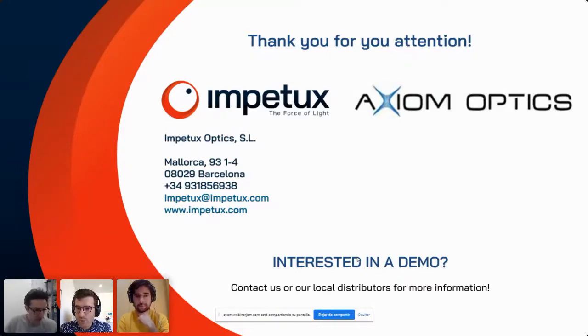We had a first question from Min, which was, what difference in index of refraction between sample and solvent is required in order to trap an object with the system? To which Arnaud, you answered that the only requirement is to have the refractive index of the particle larger than the one of its surroundings, right? Do you want to give more info about that?